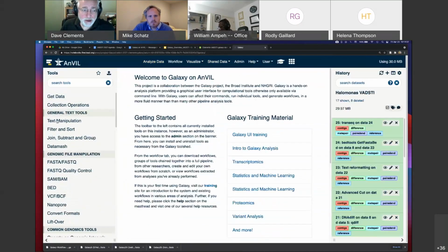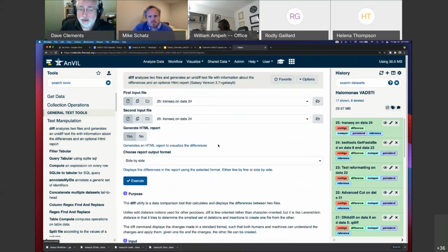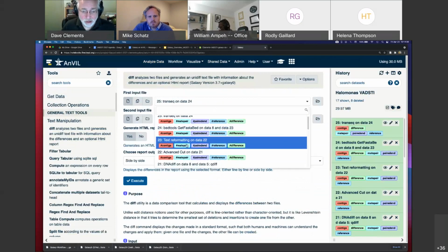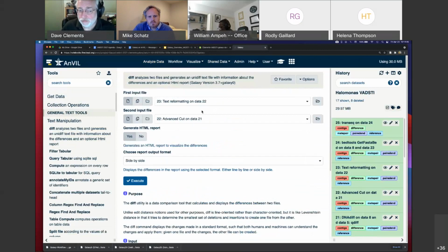I'm now going to go back and run it to demonstrate that it actually works. And I'll show you one thing I didn't do. Okay, Transseq on data 24, that's not what I want. What I want to do is compare my text reformatting on data 22 with my cut to see if it actually changed it. And I say, no, I don't really want the HTML. I just want to see the text. And I do side by side. That's great. I do execute.